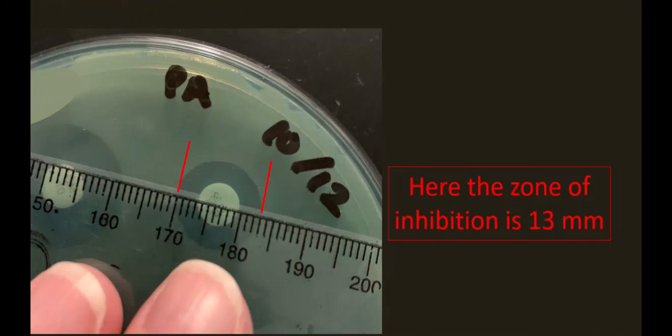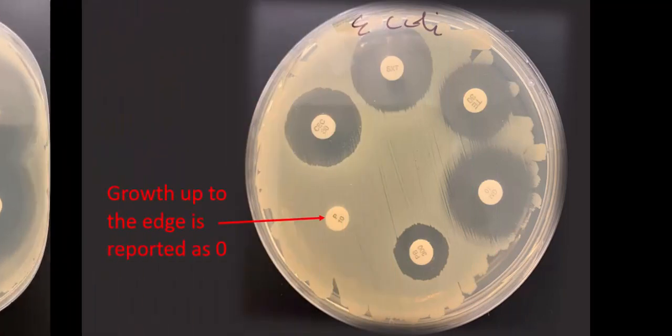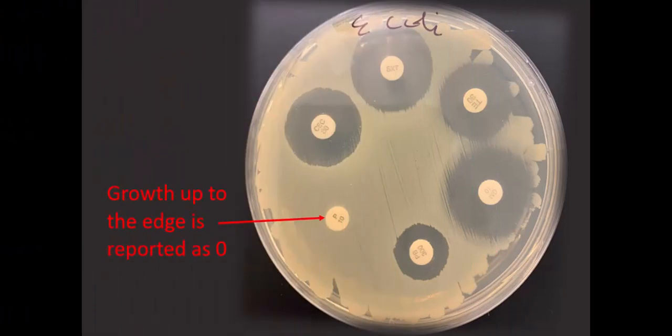To do this, view the bottom of the plate and measure and record the diameter of the zone of inhibition for each disc. Note that the measurements must be in millimeters. If two zones overlap or the disc is close to the edge and you can't quite measure across the entire diameter, find an edge of the zone, measure to the center of the disc, and then multiply by 2 to get the diameter. If there is no zone, that means there's growth right up to the edge of the disc, and report it as 0.